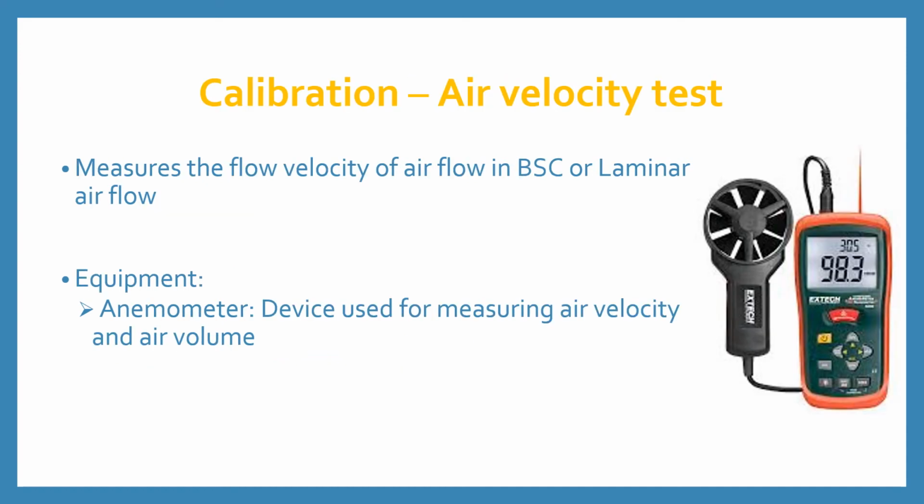Calibration by air velocity test. It measures the flow velocity of airflow in a biosafety cabinet or laminar airflow. The equipment used is an anemometer, which is the device used for measuring air velocity and air volume.